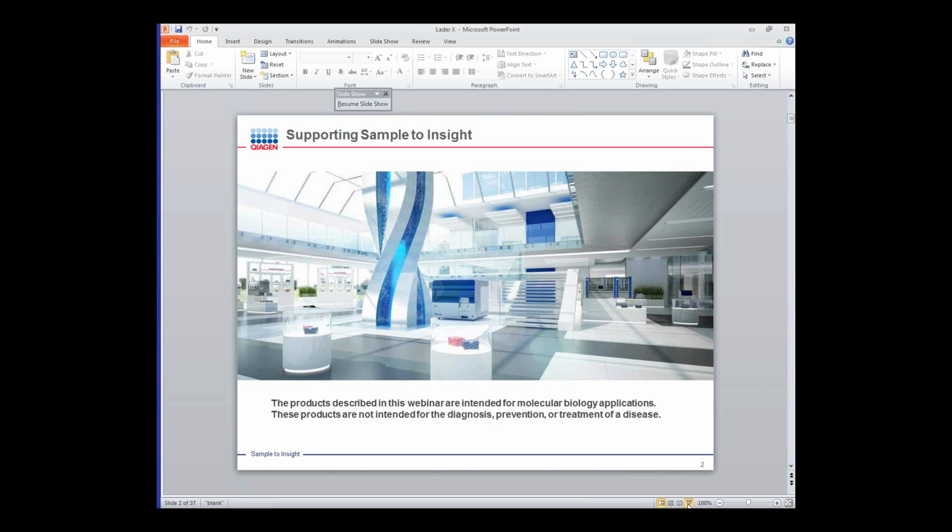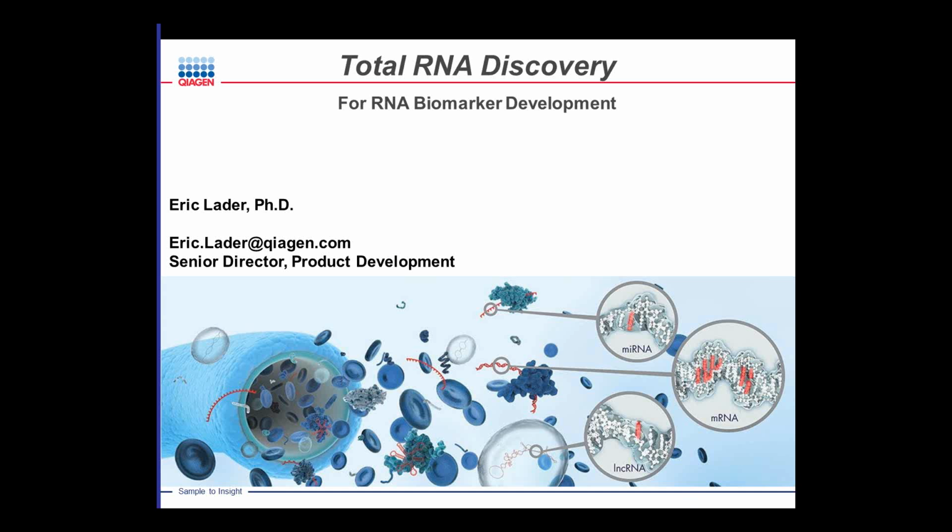What we're going to do today is I'm going to give you a broad overview on using RNA tools and technologies as a basis for biomarker development, and then hand the talk over to Dr. Deere, who will actually show an application of using this to benefit people in terms of developing a molecular diagnostic.